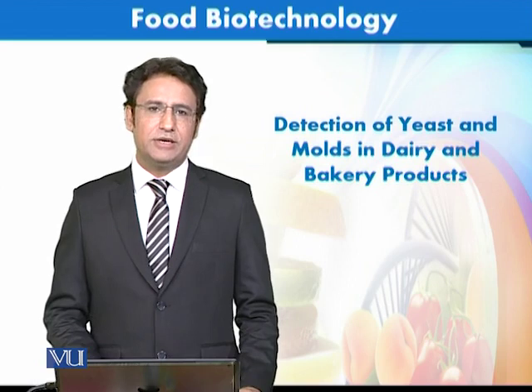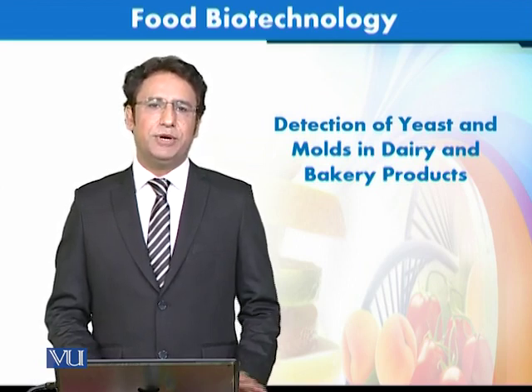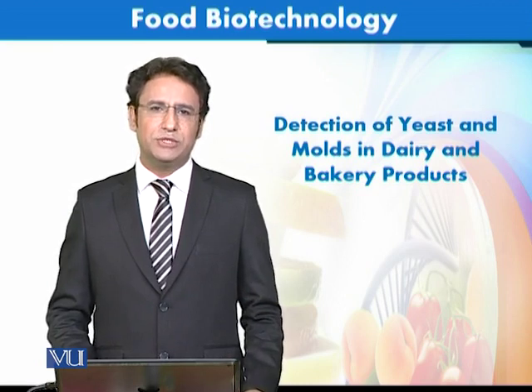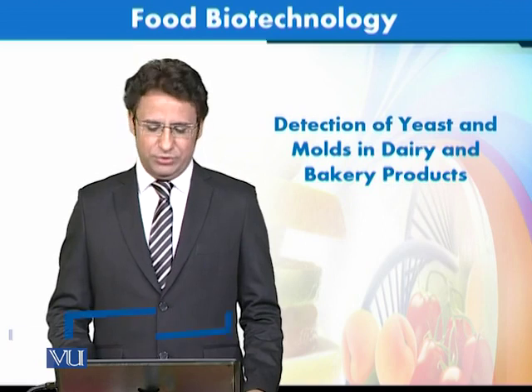Let's discuss the detection of yeast and mold in food products such as dairy and bakery products. As I said earlier, microbial analysis is very much dependent upon the food as well as on the microorganism and the strain, and they are complex methods. They may be different for different organisms and species, but we will be discussing some general approaches for determination of yeast and mold in food.